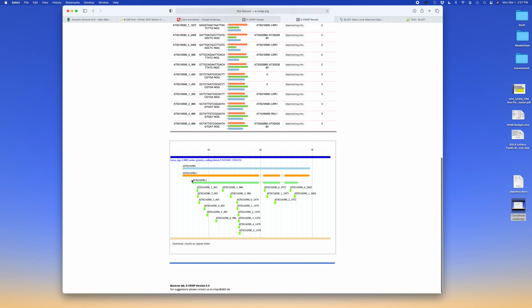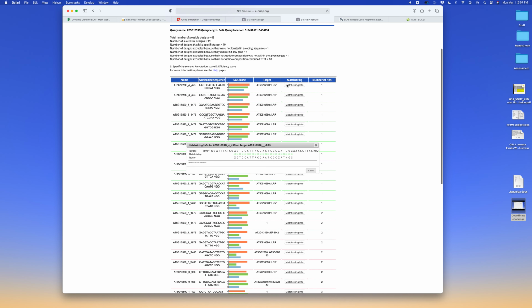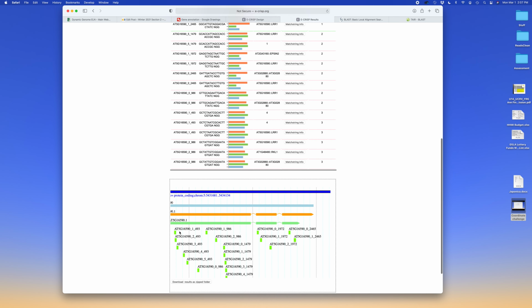That'll also be good because, if you notice, my gene is pointing to the right, which means it's on the top strand, and all the numbers are going to make sense. Some of your genes are on the bottom strand, and what you find here is going to be in reverse, so the beginning of your gene is going to have higher numbers than the end of your gene. So we're going to use BLAST to show the location relative to the coding sequence.